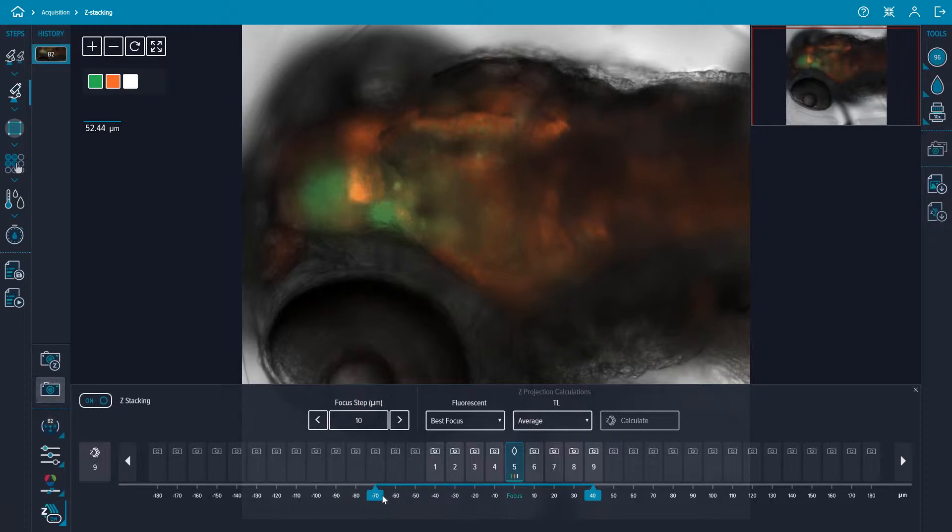Move the sliders to set the top and bottom of the z-stack and then select the snap z-stacking images icon.